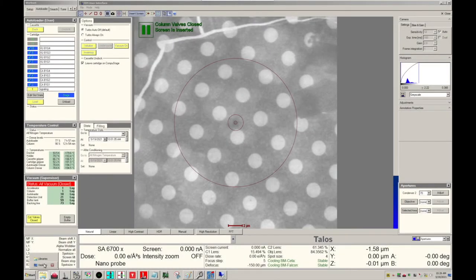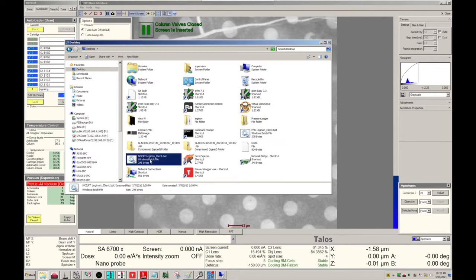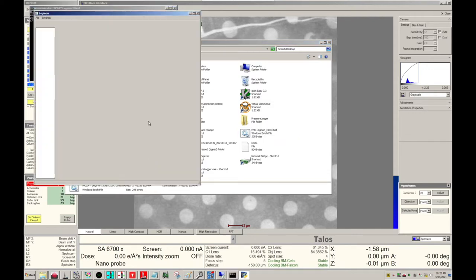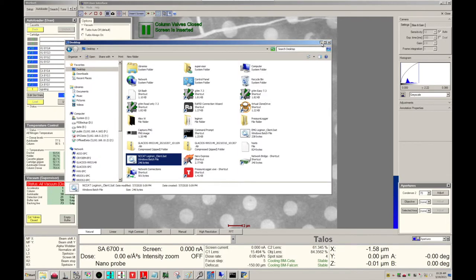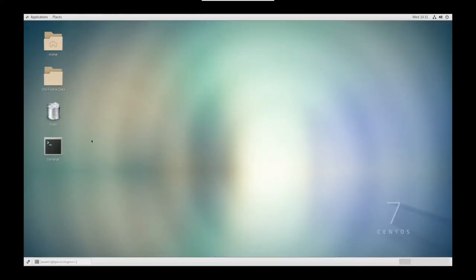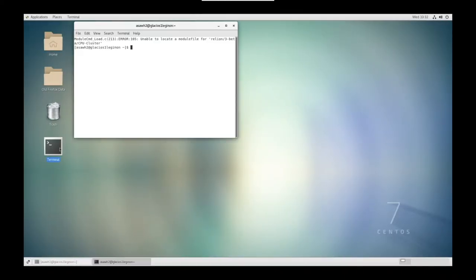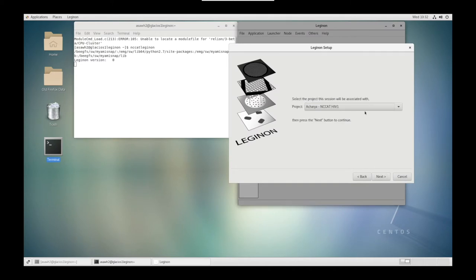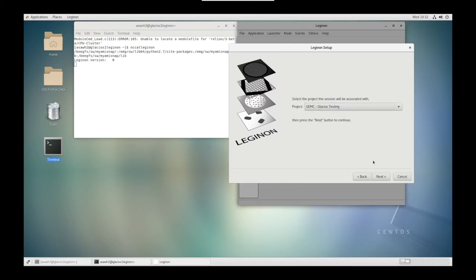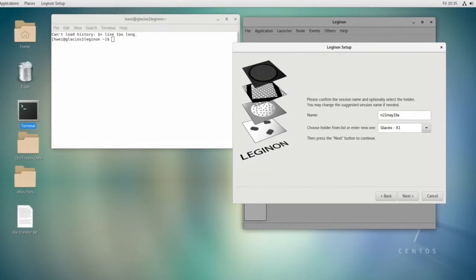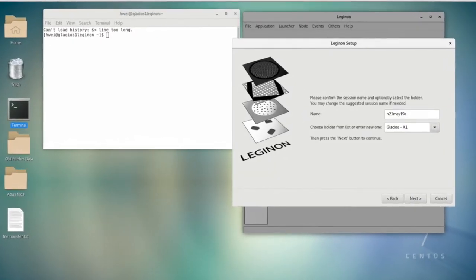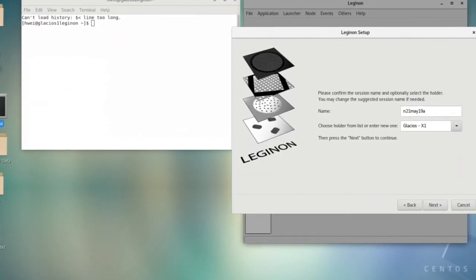On the Microscope PC, go to Desktop and load NC-CAT Legenon Client. On the Legenon PC, go to Terminal and type NC-CAT Legenon. Create a new session, next. Search for your project, next. Here, let's choose Glacios-X1 as the holder and click Next.